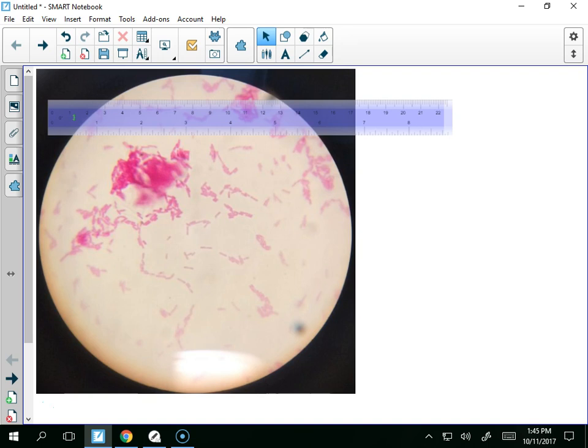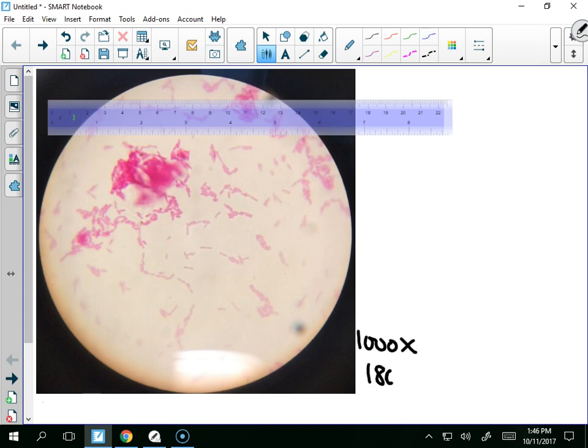That diameter gets physically smaller in space. The image of what you're seeing is not smaller. It's much like zooming in on Google Earth, okay? So we get a higher resolution. So this is a typical bacteria smear of what are called E. coli cells. They're just prototypical bacterial cells. Now, you'll notice that they're crazy small compared to the paramecium because we are currently at 1,000 times magnification. And at 1,000 times magnification, we're only looking at 180 micrometers. That's 18% of a millimeter in terms of total size.